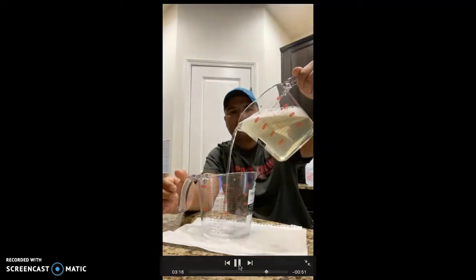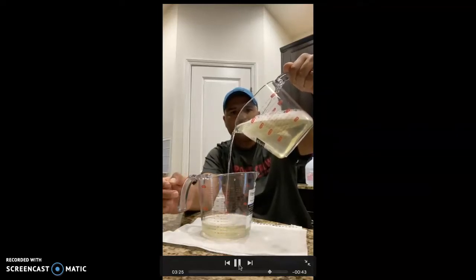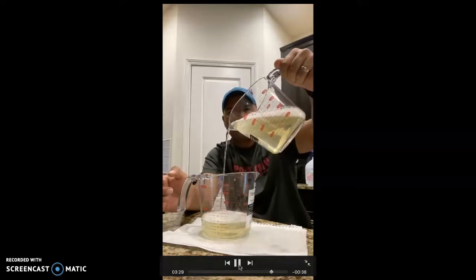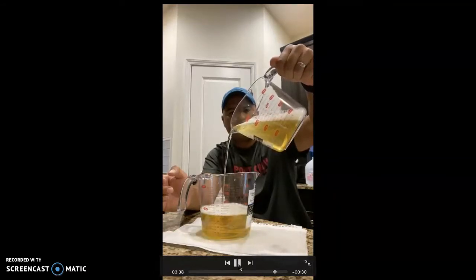So this is the one where you transfer the solution from one recipient to the other, and then after a while they're changing colors. They change color at the same time, basically, which is pretty cool. So they're starting to change color.